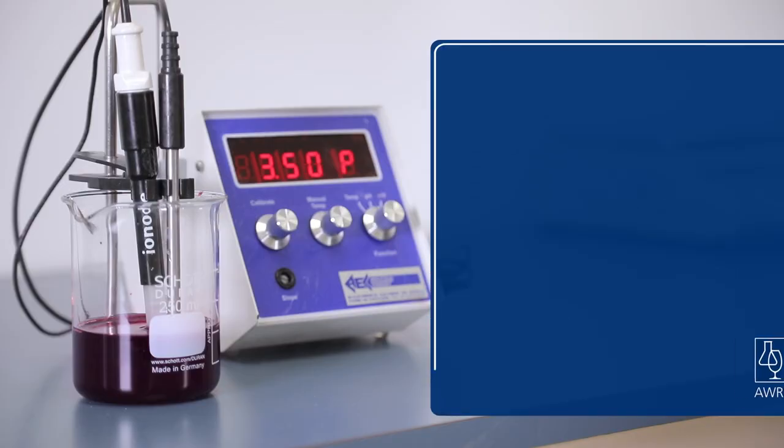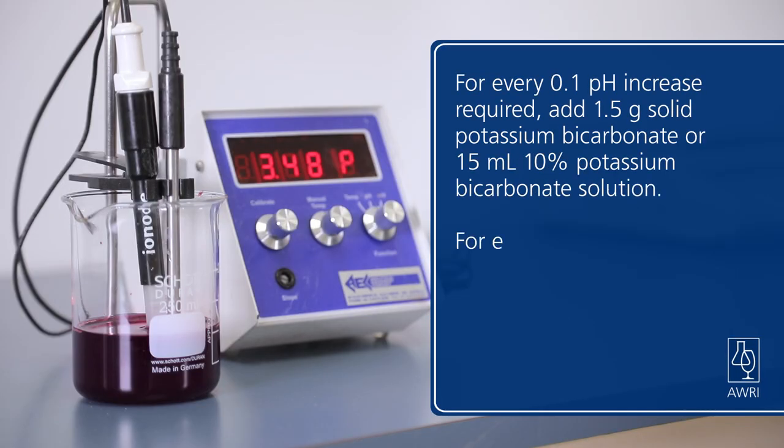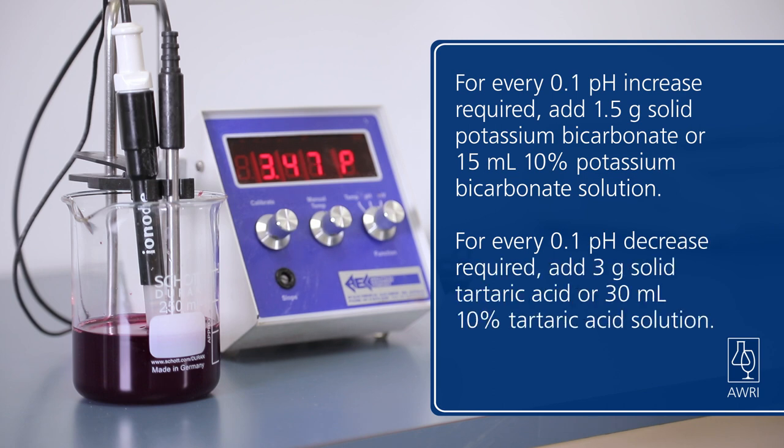Test the pH of the must with a pH meter if available. Underripe grapes might need a pH adjustment using potassium bicarbonate, while high pH grapes might need some tartaric acid to bring the pH to around 3.4.